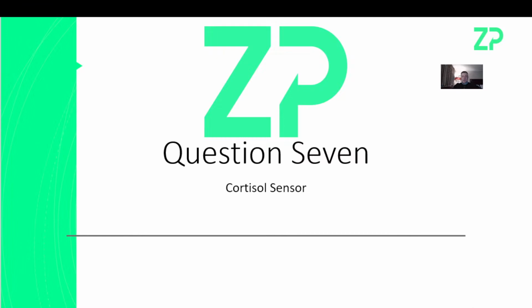I must admit, I am an electrochemist, not an electronics guy, so I'm stumbling a little bit, but it's not 0 volts. It's 0 volts versus reference. So you do have to put some voltage versus reference, or not some, but it might make it easier if I told you to apply 1 millivolt versus reference, because 1 millivolt is essentially the same as 0 volts, but it's so small. But then you would say, all right, now I am applying something.